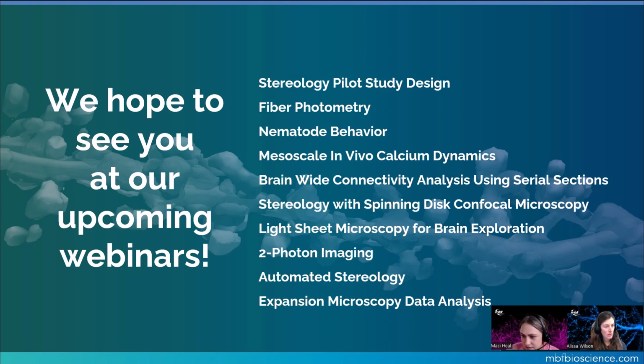There's a question that came in about vessel branching, if we can analyze the vessel branching similar to how we can for dendrites, and yes, there's Sholl for vessels as well. Yeah, with Sholl, you can place a marker where you want the center of the Sholl. Right. So there are some custom options you can do there depending on how you want to analyze that. Yeah, because typically with dendrites, the Sholl is centered by the soma. So for a vessel, you can use a marker to do that.